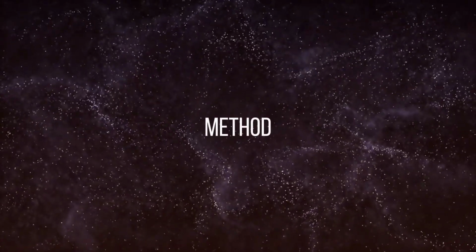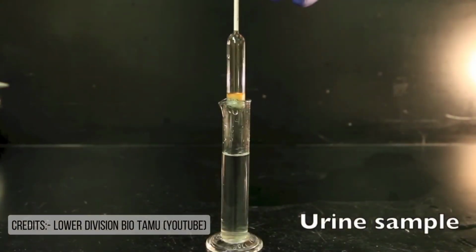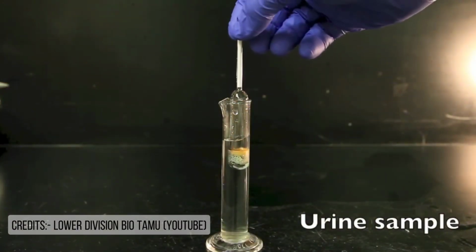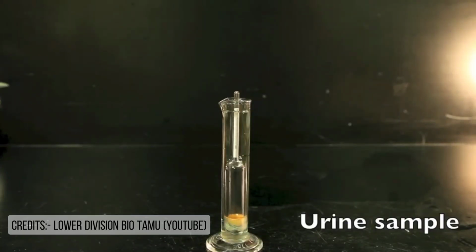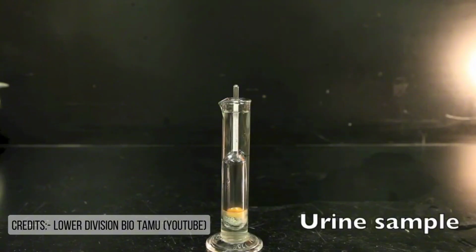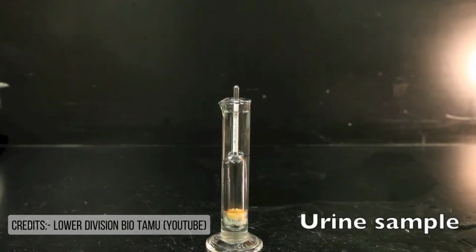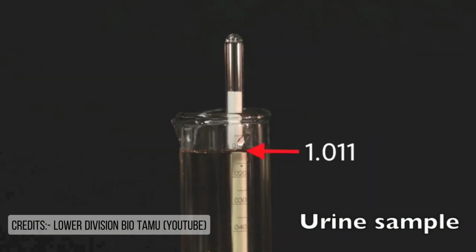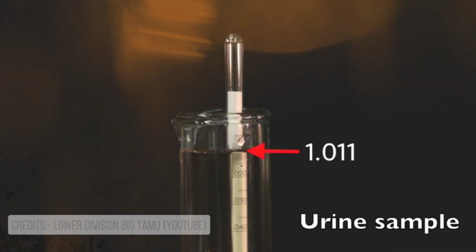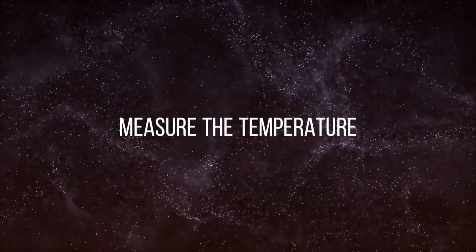To measure the specific gravity of urine, put the sample of urine into the measuring cylinder. If the urine sample is small, dilute it with water at a known percentage. The urinometer is then gently floated in the urine. Wait for it to settle. The urinometer must not be in contact with the sides of the measuring cylinder. The depth to which it sinks is observed directly from the calibration and recorded. Using a thermometer, the temperature of that sample of urine is measured.